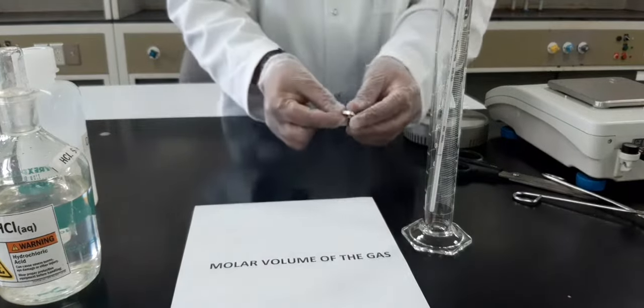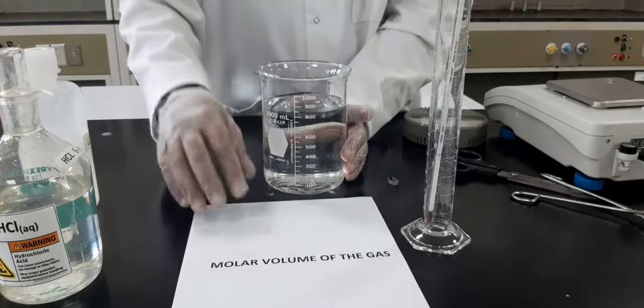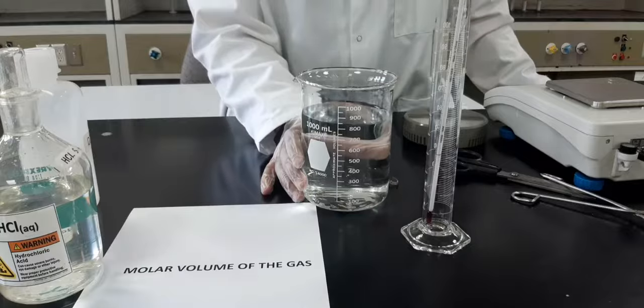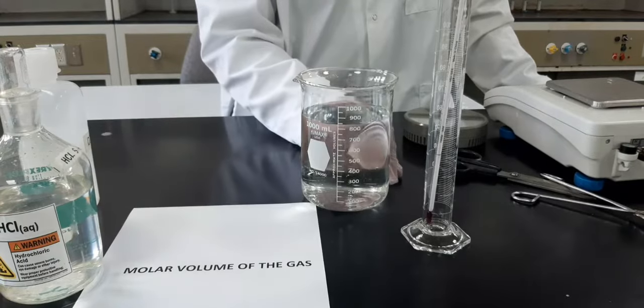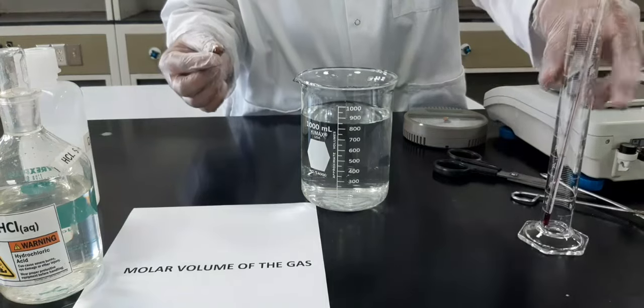Okay, and then you will take 700 to 800 ml tap water in the beaker. I have a beaker of 1000 ml here and it's almost 800 ml tap water. Okay, now you have the piece of magnesium there.